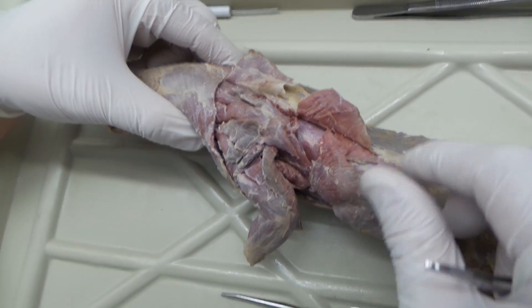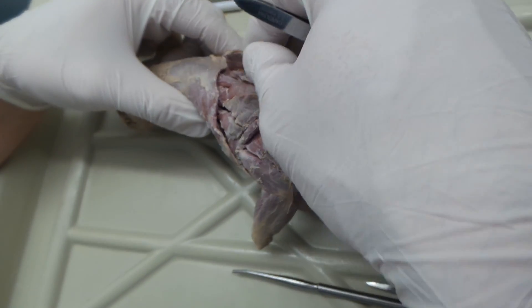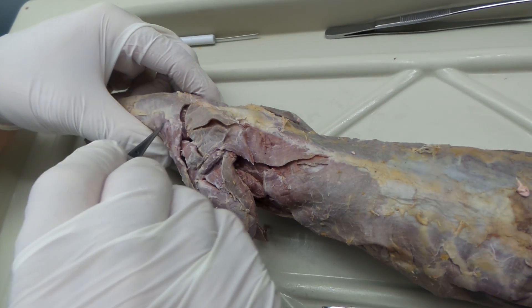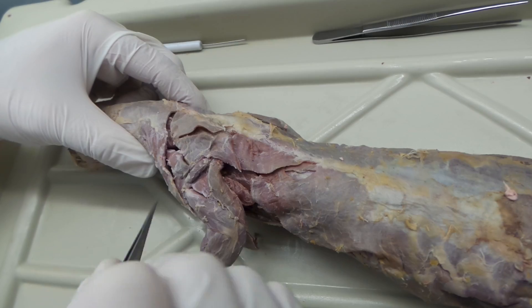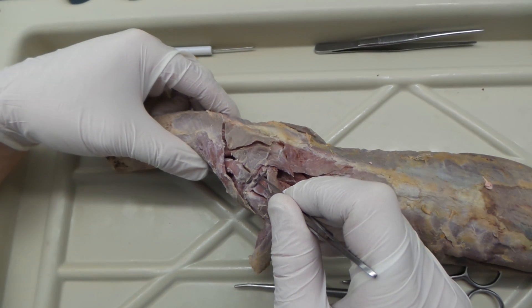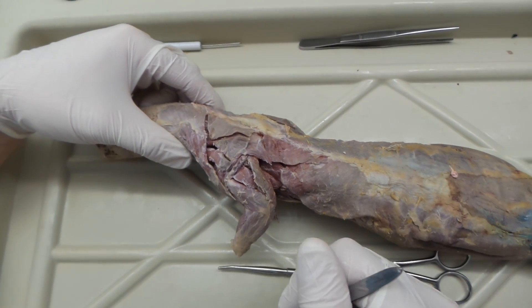To recap, for day one the muscles are: latissimus dorsi, spinotrapezius, acromiostrapezius, levator scapulae ventralis, clavotrapezius, clavodeltoid, acromiodeltoid, spinodeltoid, and epitrochlearis. That's it for day one.